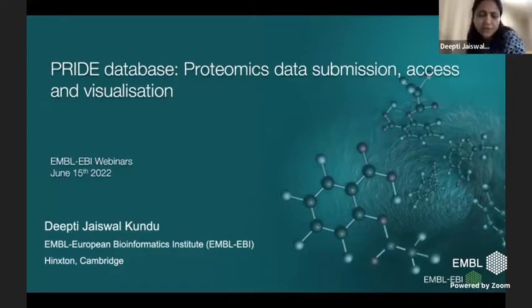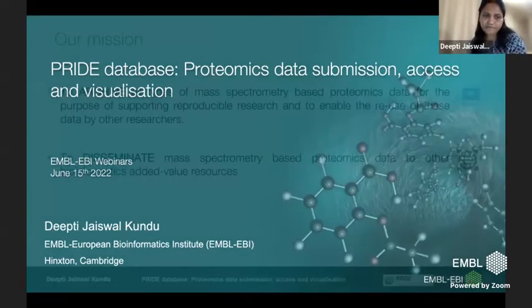So just to make sure that this is going to be a very basic tutorial about the whole process, and I'm going to talk a little about the PRIDE submission process and our web page.